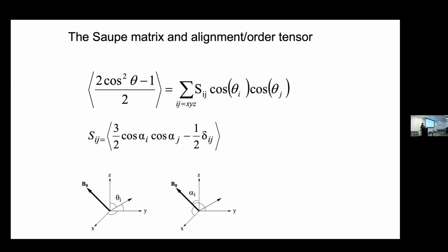It makes sense that the RDC enjoying the greatest value is the one experiencing the least variation relative to the field. If you were sitting on that vector and you were interested in a roller coaster ride, you'd have the most boring roller coaster ride because you'd be mostly ordered relative to the field. So that's the z direction that defines it.